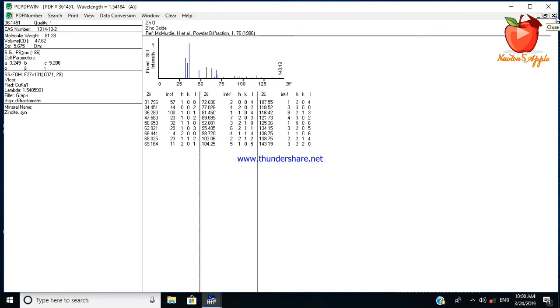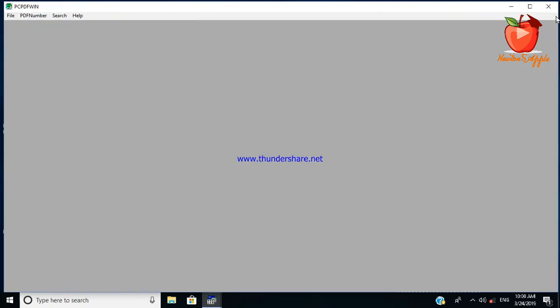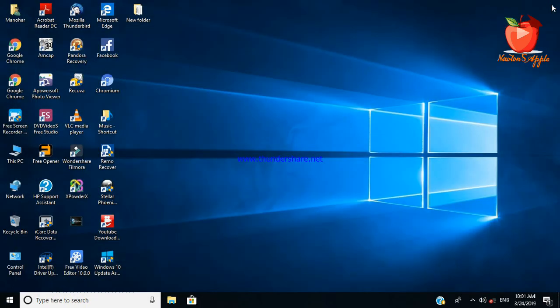So this is about the XRD, how to see it on PC PDF Win.